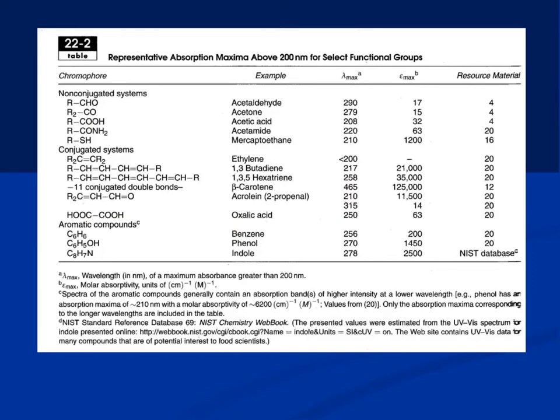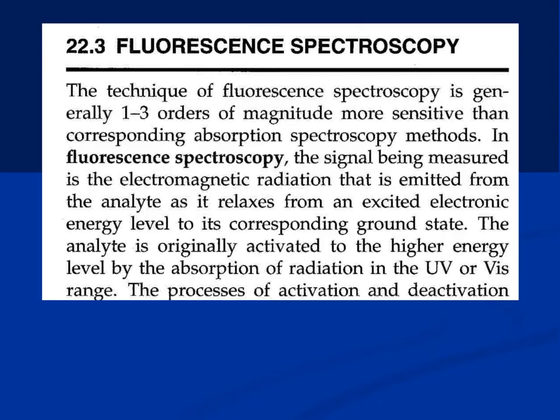Only when you have a lot of double bonds and a bigger molecule, like anthocyanins, carotenoids, and many other dyes which we use in our Biuret method and all that. They are of course copper salts and all that, so they are colored. So anything with color can be done with the visible light. Otherwise, most of the organic molecules are colorless.